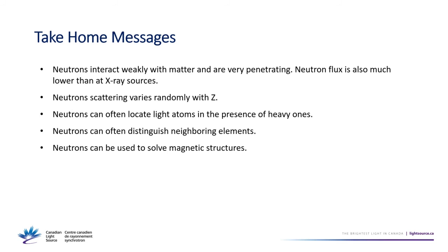Okay. Any more questions? Anton, oh, sorry. Yeah. So you mentioned that in the time of flight configuration, we have a set of detectors at different angles, right? And then you can get, let's say, 5 data sets to refine. Do you average the results then, or do you just refine them all separately? Well, you do a simultaneous refinement of all of them. Oh, okay, so all at the same time. So you're refining the same parameters to 5 different sets of data.